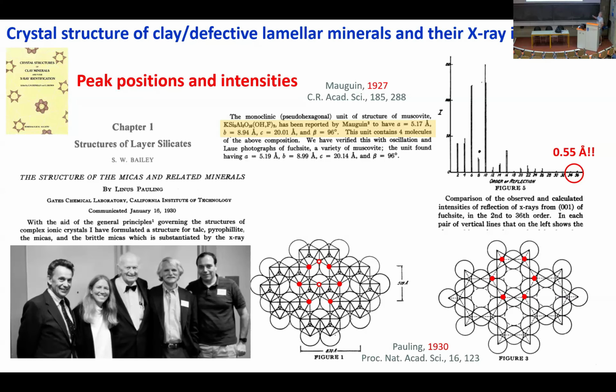And from that, they were able to determine unit cell parameters and essentially the motif of the unit cell. And you can recognize here the sheet of tetrahedra and the octahedral sheet lying in between, with dioctahedral character with vacancies here.